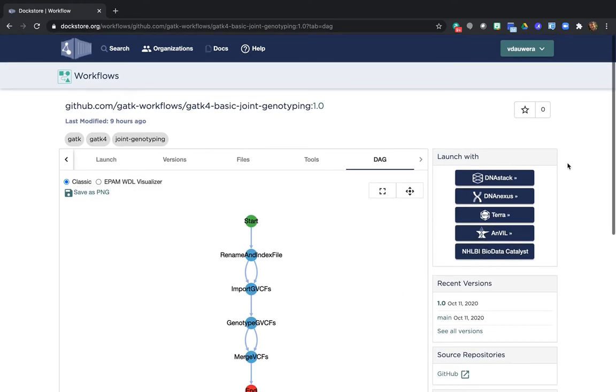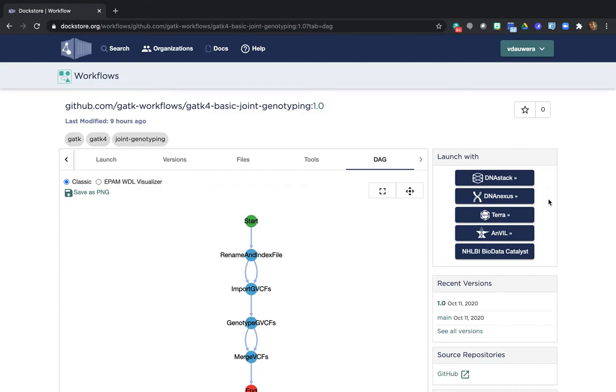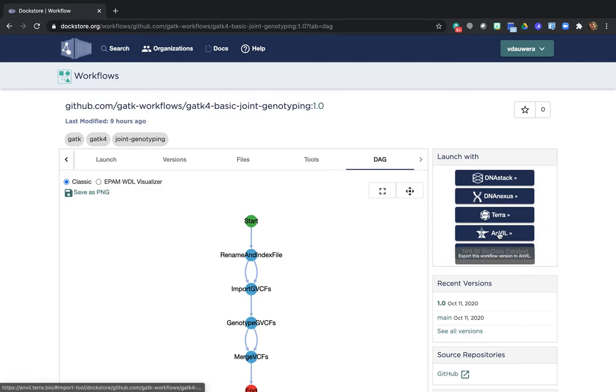Finally, let's head over to this panel over here that says Launch With. You see it lists all these platforms, including Anvil and Terra. And these are all platforms that connect to Dockstore under the hood, which means I just need to click the relevant button to send this workflow to the platform where I want to run it. So we're going to click on Anvil, which will take us back to the Anvil-branded side of Terra.